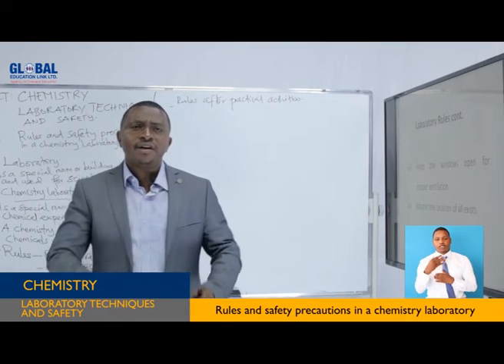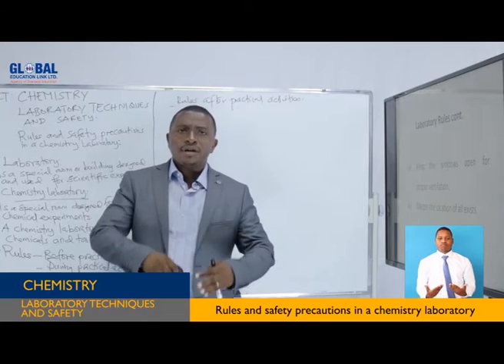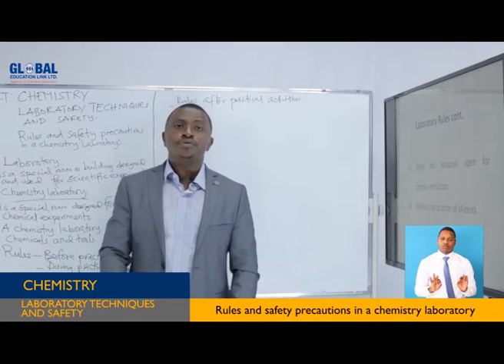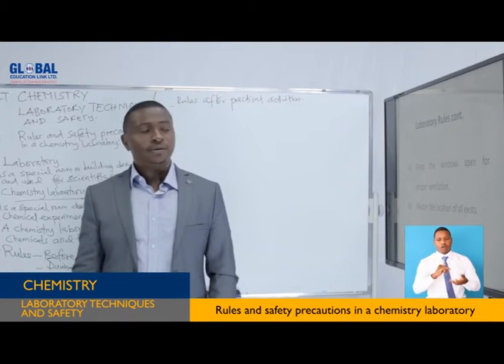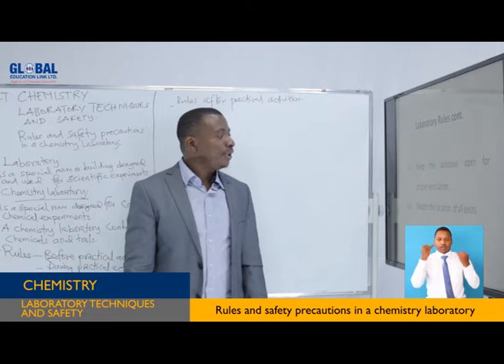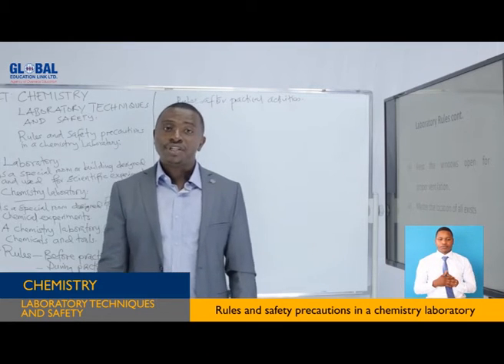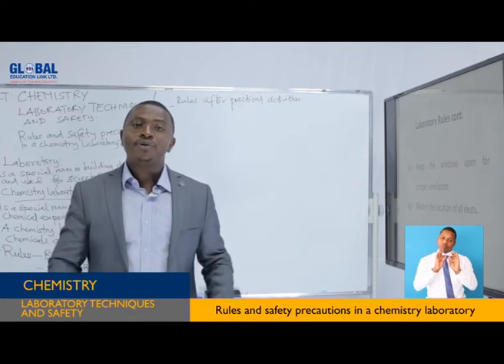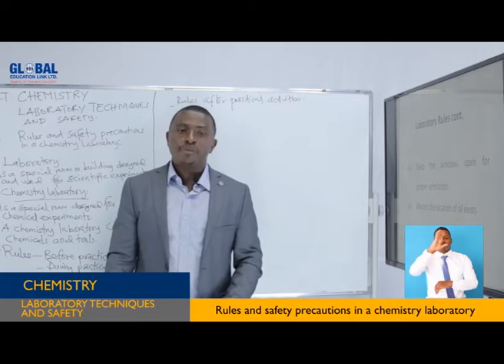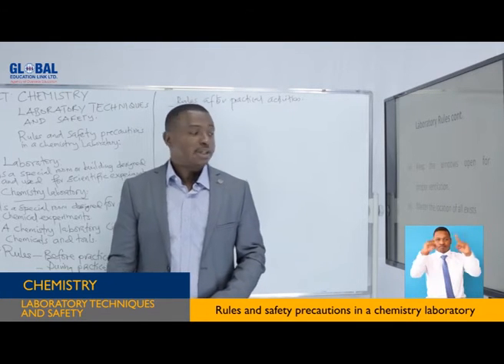Fresh air leads to a comfortable breathing environment for you and your friends. So you are very much advised to open windows for proper ventilation. Proper ventilation also moves out harmful or poisonous gases. So your laboratory should have proper ventilation to avoid suffocation.